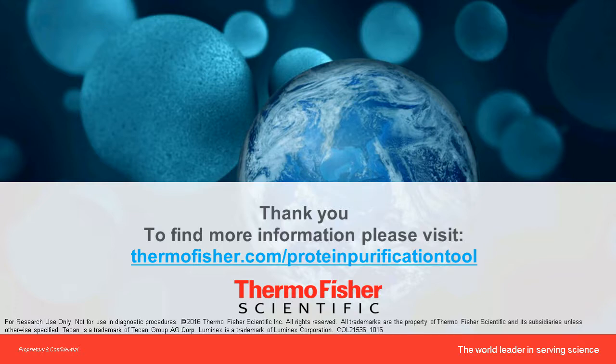Sure. So we have optimized mass spec compatible IP kits, which come with all the reagents that are necessary to perform the IP, and the eluate is going to be mass spec compatible after you complete the IP. It comes with the elution buffer. So yes, we recommend that you use that elution buffer, which is mass spec compatible, to elute just the proteins off the bead. And as I mentioned earlier, there will be some antibody that will be leached in your IP eluate, but with IP LC-MS analysis, that usually never creates any problem.